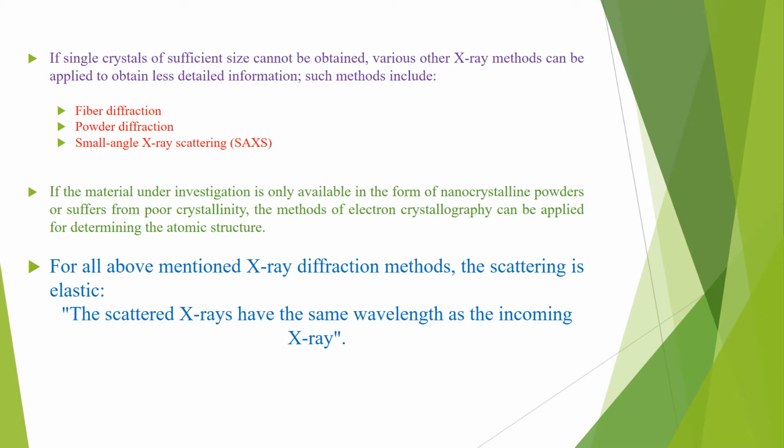That means no change in wavelength occurs when the X-rays strike the crystal and get scattered. So both the incident X-rays and the scattered X-rays have the same wavelength.